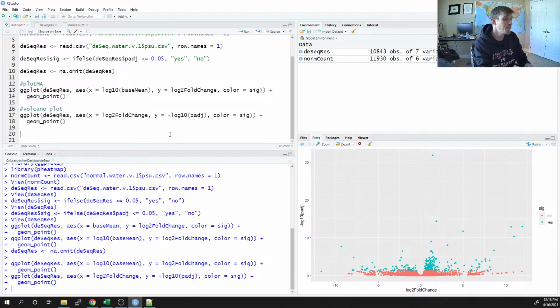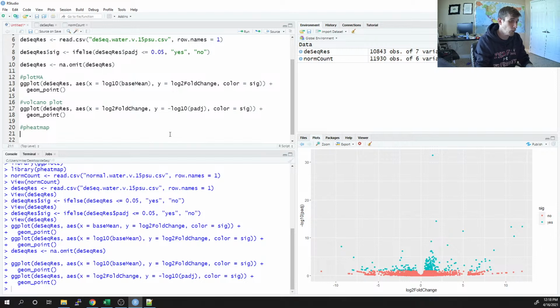But I have to manipulate this data a little bit. I have to manipulate the recount data a little bit. And I'm not that great with R. I do what I can, but I'm certainly not the most versed in what R can do.